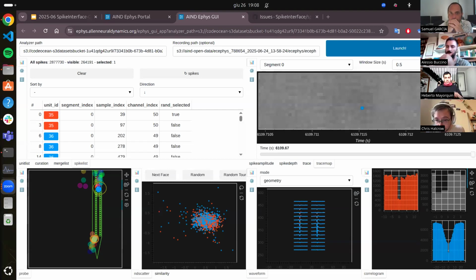But now that I'm saying it out loud, it might not be the case because everything is embedded in the link. And just for you guys to be aware, this new launcher feature is quite new, something we did over the last couple of weeks. So there might be some edge cases that we still need to iron out, and this might be one. I'm not sure, we need to try.